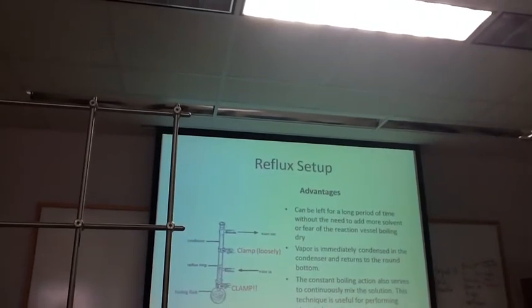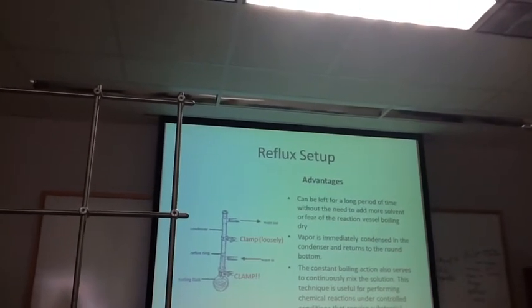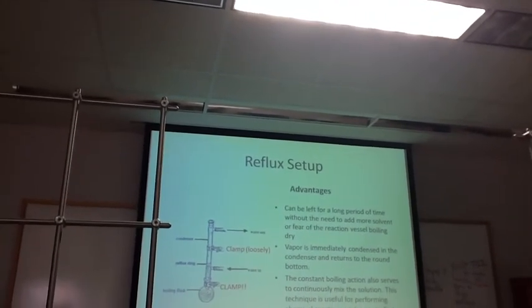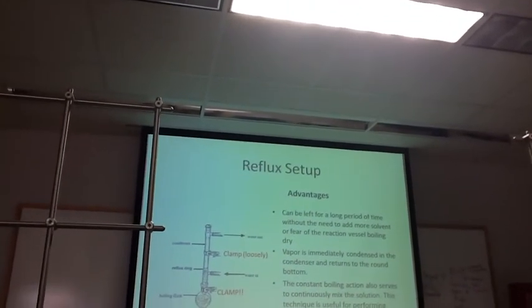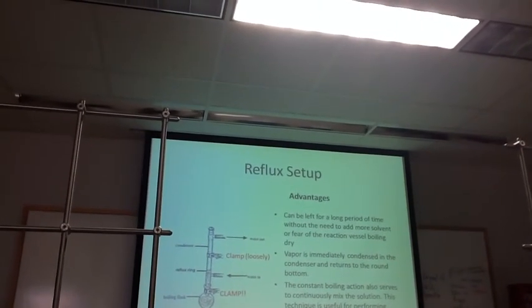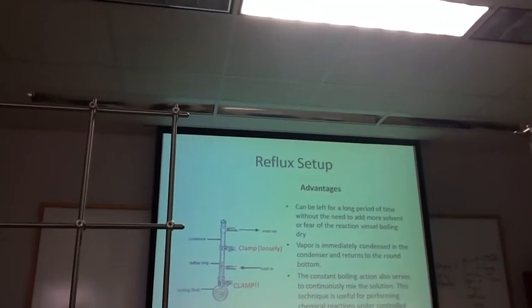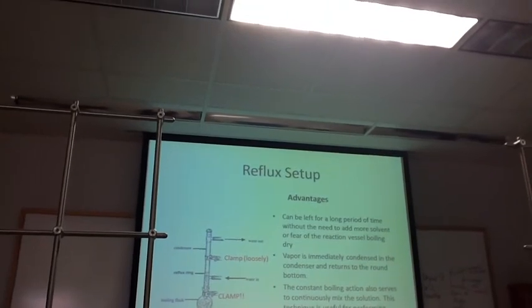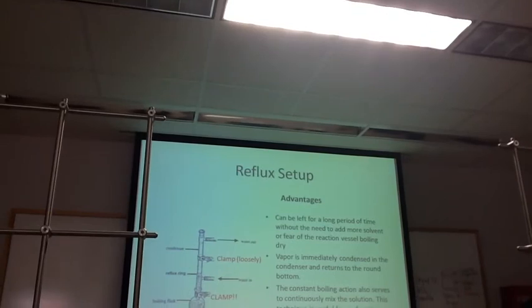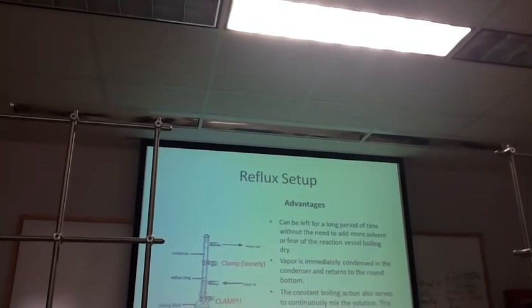Okay, so reflux. First of all, can anybody tell me what distillation is? What's the purpose of doing a distillation? Separate. Okay, the purpose of distillation is to separate your components. Not necessarily purifying, but the main purpose is to separate it. To get one product over here, one product over there. Reflux is a very similar setup in that you're going to do things like you would do a distillation. However, we're going to have a closed system so that we don't lose anything during a reflux. You want to be able to add heat to your reaction and just let it sit there, keep adding heat to it without losing any of your products or having anything separate out.